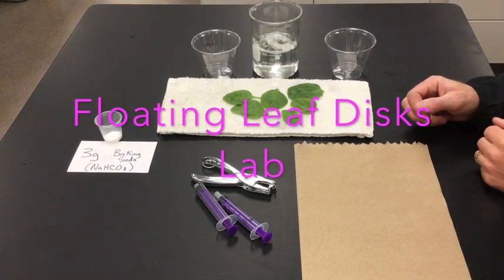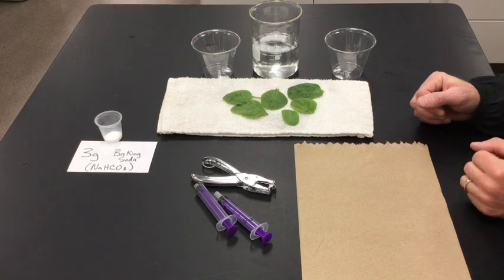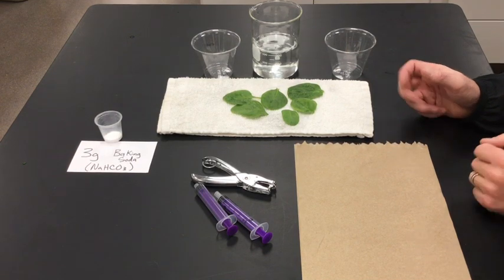Hello, this is Mr. Buss and I'm gonna walk you through how to set up and run the floating leaf discs lab.